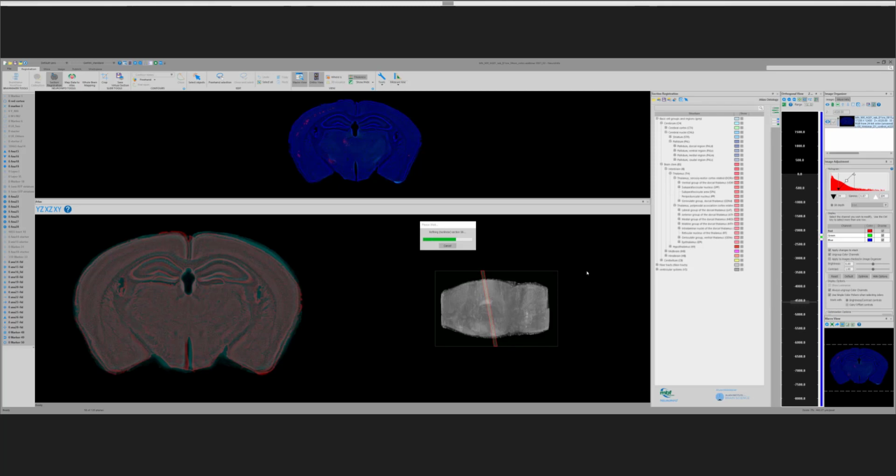Right, and so what we can do is click to visualize these, and we'll provide an overlay into the registration itself. You can see as you're moving your mouse, in yellow below the overlay image, the name of the anatomic region that your mouse is hovering over. So we're in the lateral habenula, the dentate gyrus, CA1, CA3. Does it get CA2? Yeah, even CA2. That's pretty impressive. Amygdalothalamic tracts, basolateral amygdala.